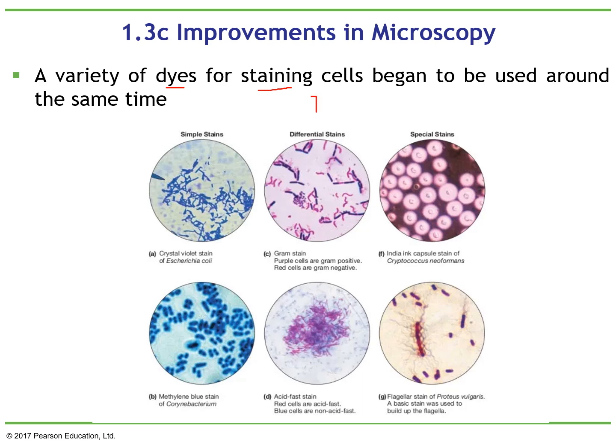Maybe you have seen this one, that is for gram staining, where you can see bacteria. In this class, we will use methylene blue to see the viability of the cells. Very useful. There are many different types of staining, and we use them because, if you remember, there are cells in the bright field that are transparent.